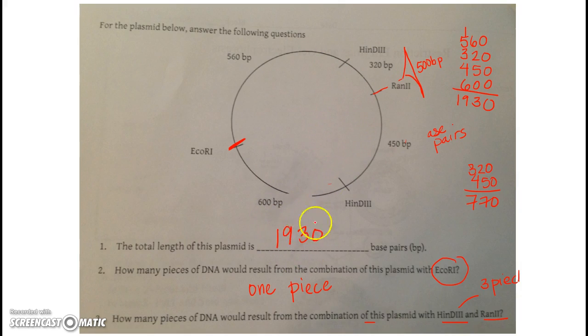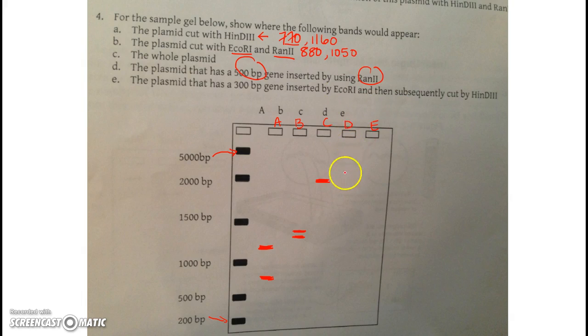So if that insert works correctly, this plasmid should get 500 base pairs bigger. So instead of being roughly 2,000, it's going to be 2,500. And so if we were trying to do that, we would look for a piece about 2,500, so it'd be kind of higher here, okay? Now, let's look at E. 300 base pair gene inserted by EcoR1, then cut with Hindi3.